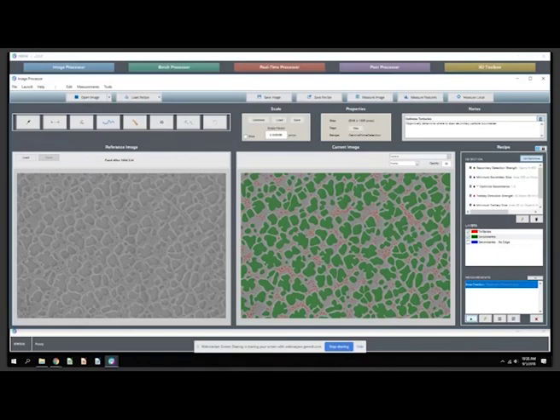And for one of the first times, as they report in the image analysis pursuit of this problem, the segmentation area fractions match nearly identically with the historic phase extraction wet chemistry technique, and that is why they are so confident in promoting this as a new standard.